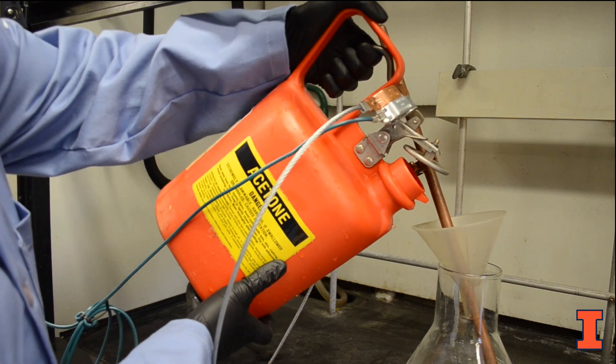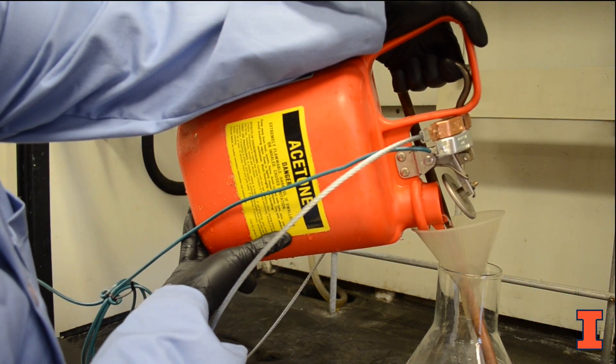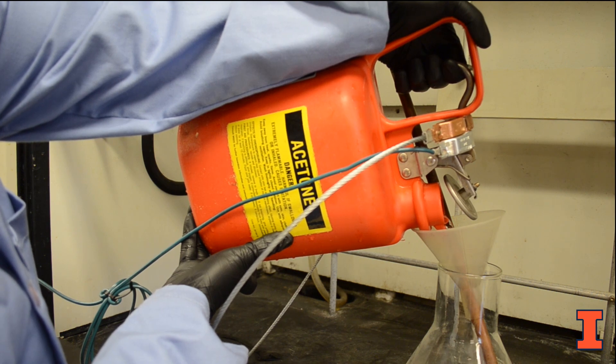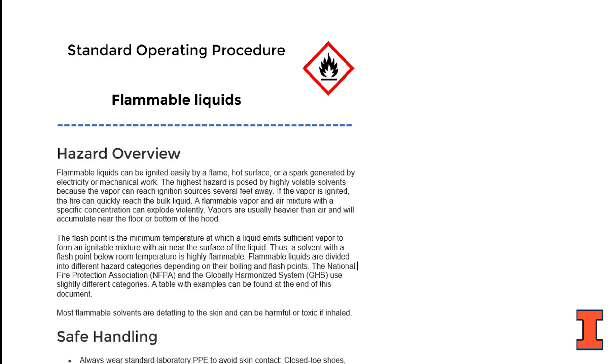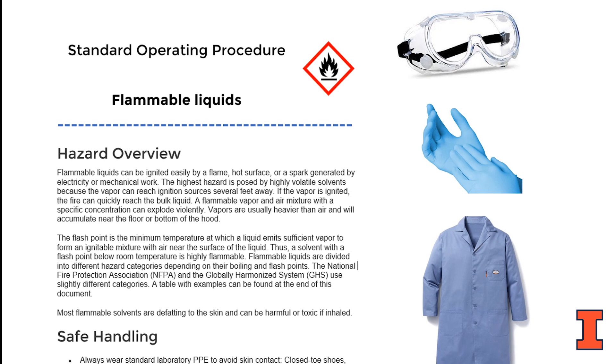You may now proceed slowly with the transfer in a well-ventilated area or inside a fume hood, away from heat sources and electrical equipment. A standard operating procedure for dispensing flammable solvents should be added to your group's lab safety plan. Be sure to wear appropriate eye protection, gloves, and a flame-resistant lab coat. Know the location of the closest fire extinguisher, exit, eye wash, and safety shower before proceeding with the transfer.